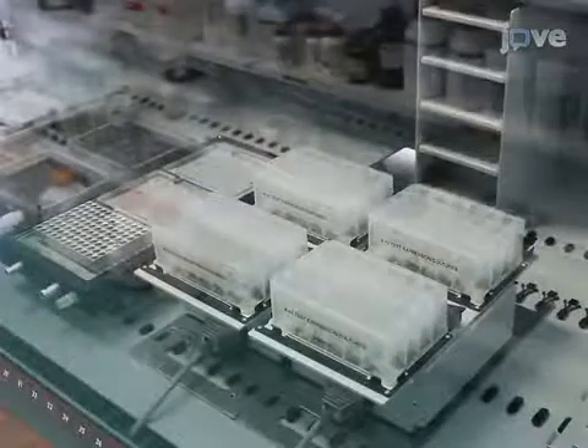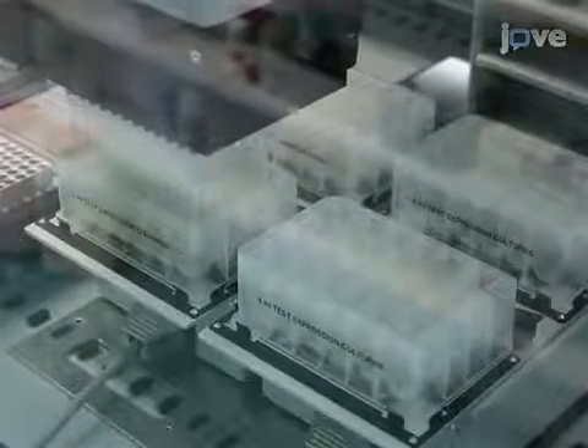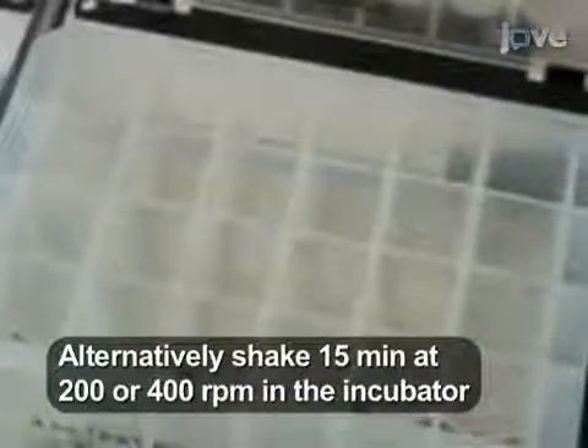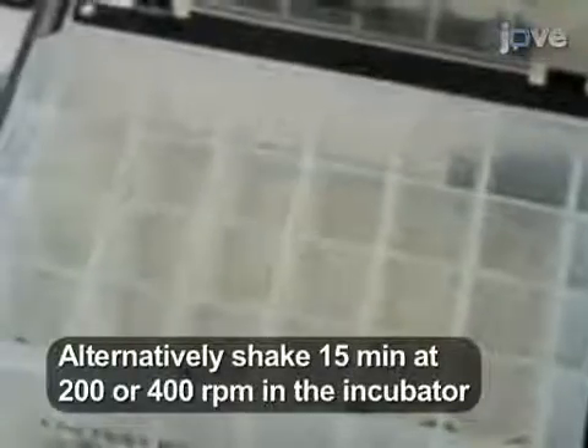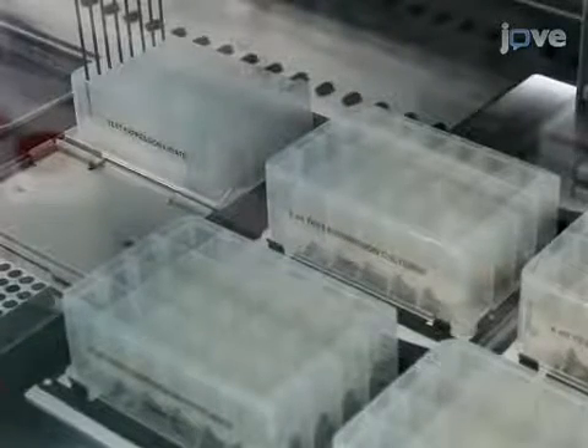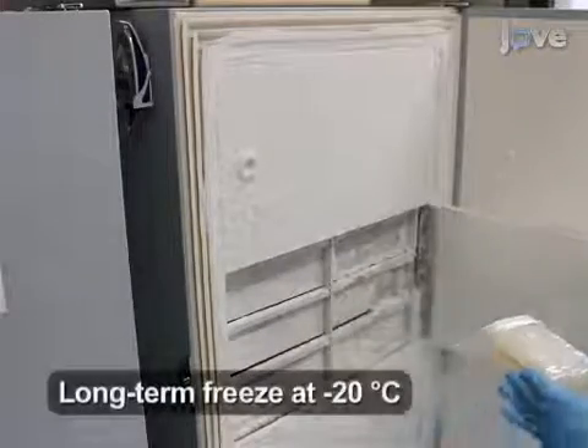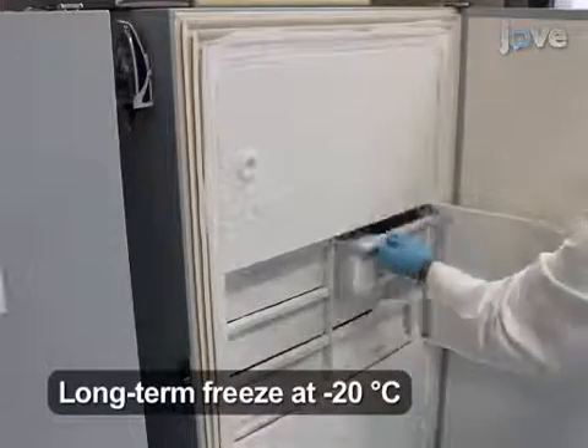Aspirate 125 µL of lysis buffer and dispense the buffer twice into each well of the deep well 24 plates, with 4 tips into each well to reach the final volume of 1 mL of lysis buffer. To re-suspend the pellets, shake the plates at 1200 RPM for 5 minutes on the robot. Transfer the cell suspensions back to the appropriate wells of a deep well 96 plate, and store the plates sealed at -80 degrees Celsius for a minimum of 1 hour.